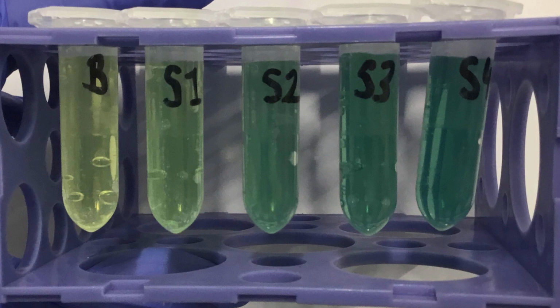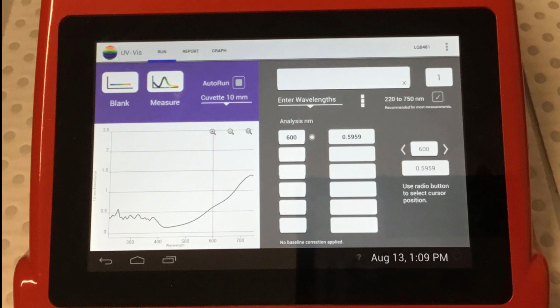Beautiful. Here's a photo of the spectrophotometer with the absorption spectra for the highest glucose standard, which is 0.06 micromoles. So from this you can decide whether you think your spectrum looks okay. And of course, if you have any problems, make sure you speak to your demonstrator as soon as possible so we can help you fix things.